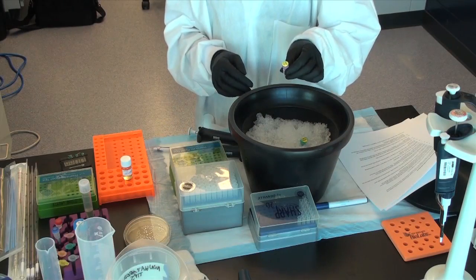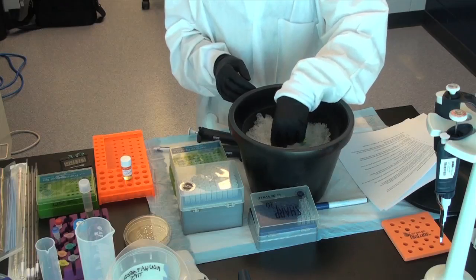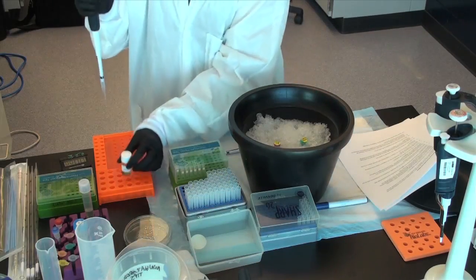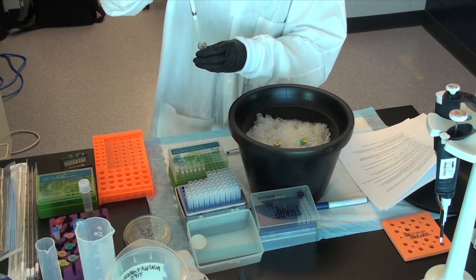Step 9: Remove the vial from the 42 degrees Celsius bath or block and quickly place it on ice for one minute. Step 10: Add the appropriate volume, 250 microliters, of pre-warmed SOC medium to each vial.